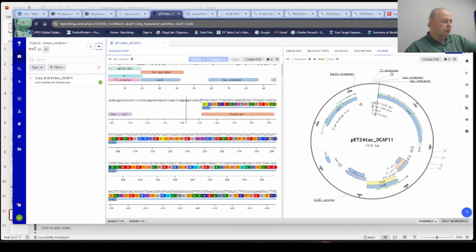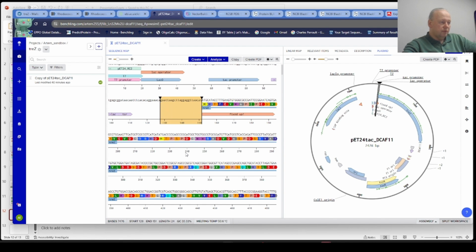All we have to do now is to design a series of cloning tools, a couple of primers here and there, to facilitate the cloning of our inserts that will be synthetic, probably ordered from Twist. Nice and affordable DNA, usually good delivery times and so on. So certainly many companies do that, we just happen to like Twist. IDT DNA is good too, but a lot more expensive. Anyway, let's design some primers.